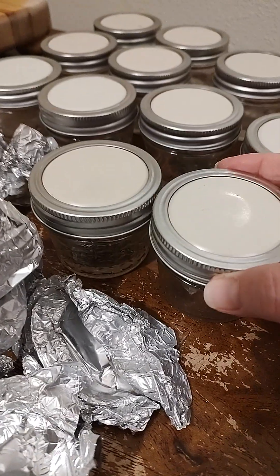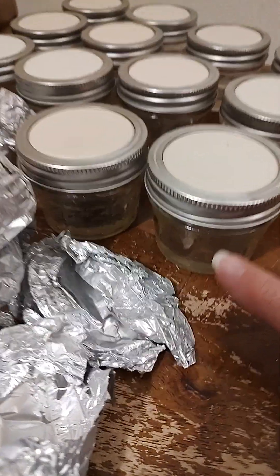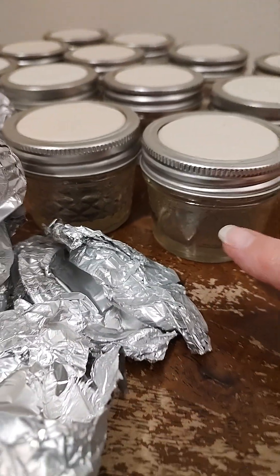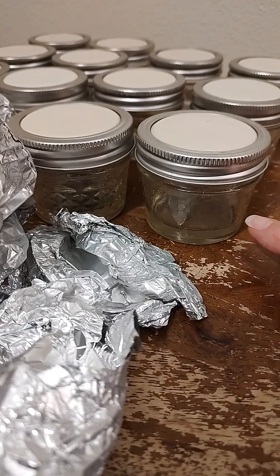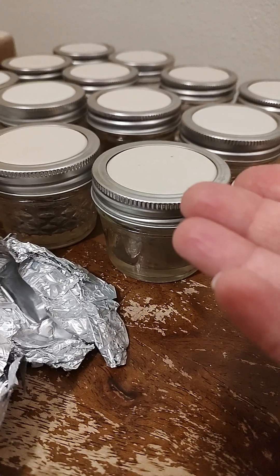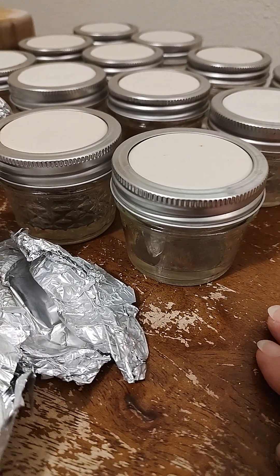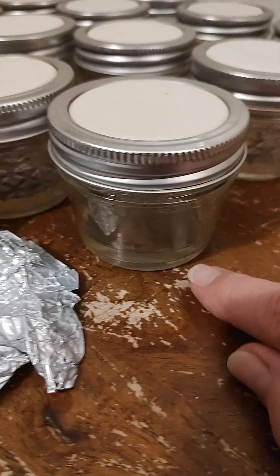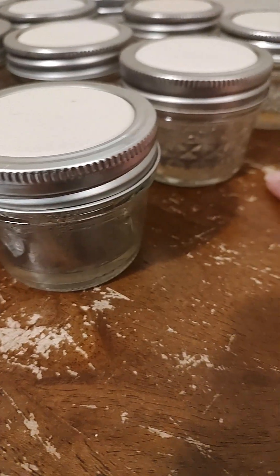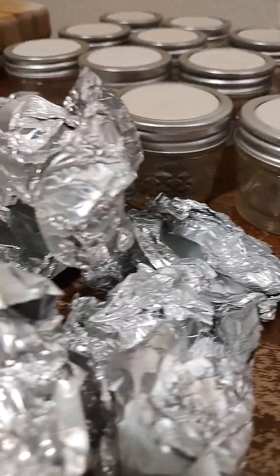We flip the lids on the no-pour jars because it helps eliminate extra moisture buildup. Once it cools to room temperature, I'm going to alcohol all of the tops and flip them the right way so they're ready for our clones and transfers. However, I keep everything level until it cools so that I have a level petri dish to work with.